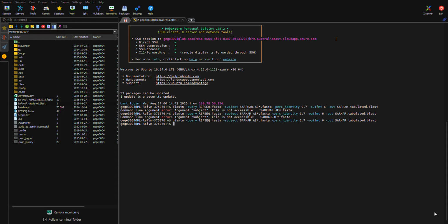Now, one thing to note when you're looking at that, sometimes different refseq accession codes match the same place. So you might see different numbers in the output file, but it's actually matching the same gene or location. And this is where we talk about the isoforms of genes again, which we talked about last week when we were looking at the genome browsers. Okay? So it's the same gene, just a different isoform, so it's going to have a slightly different refseq accession code.